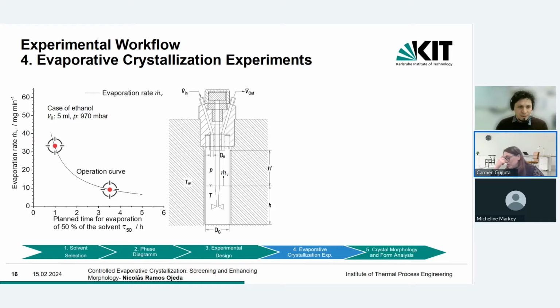And indeed, with the first version of the Crystalline, you need to do something additional to be able to get that information out. But I think the latest release of the software for the V2, the second version of the Crystalline, it's already implemented in the software.